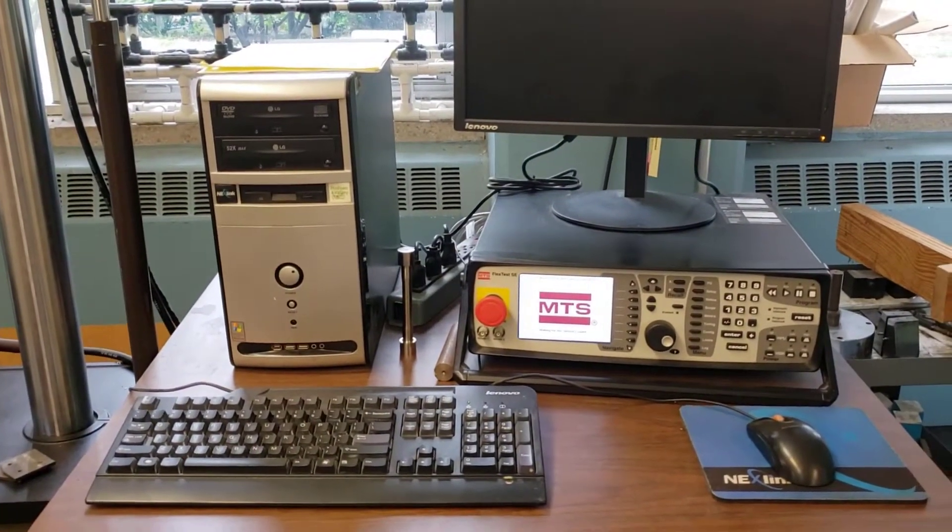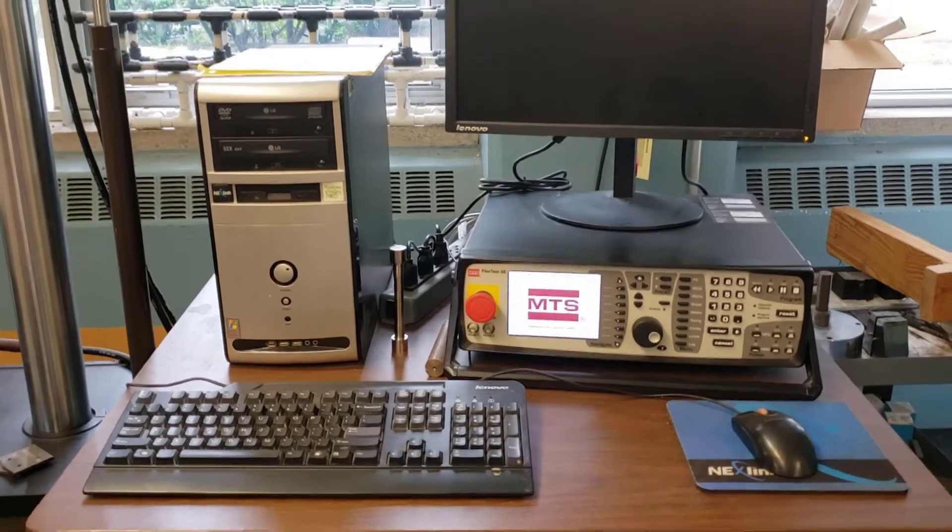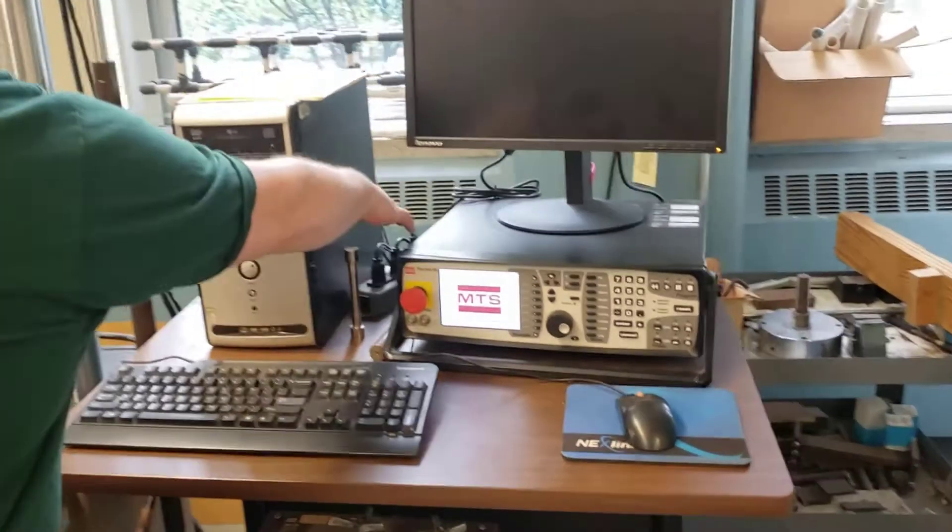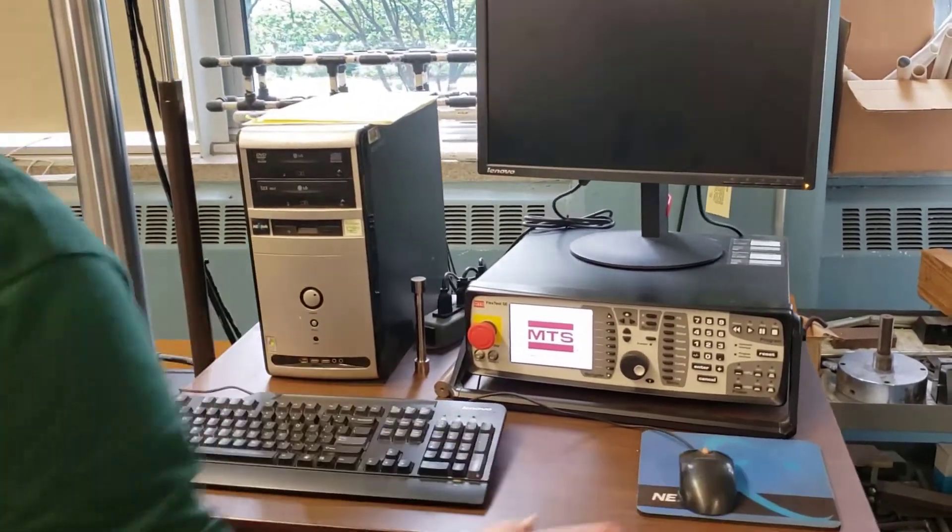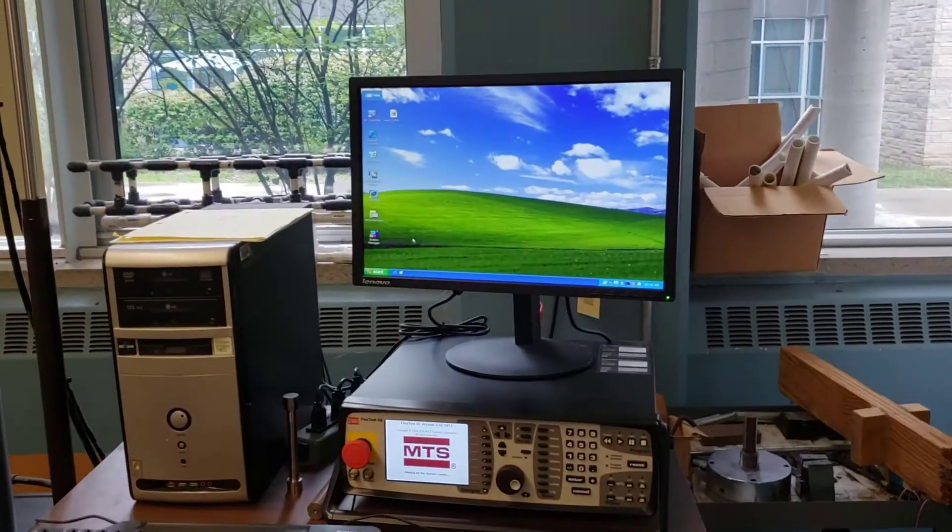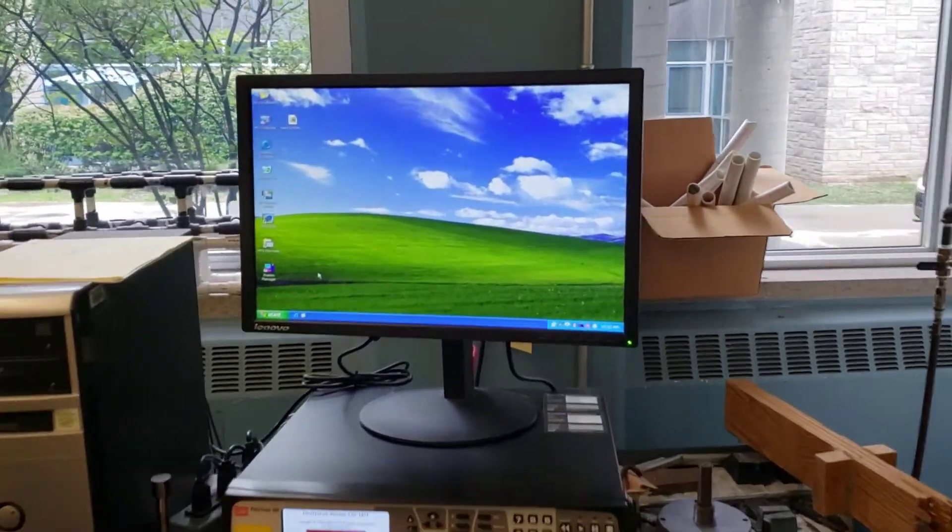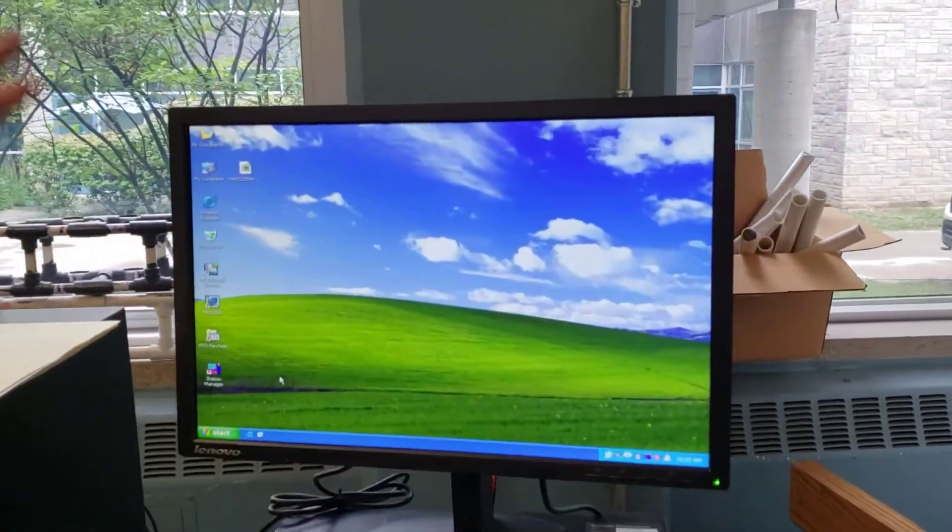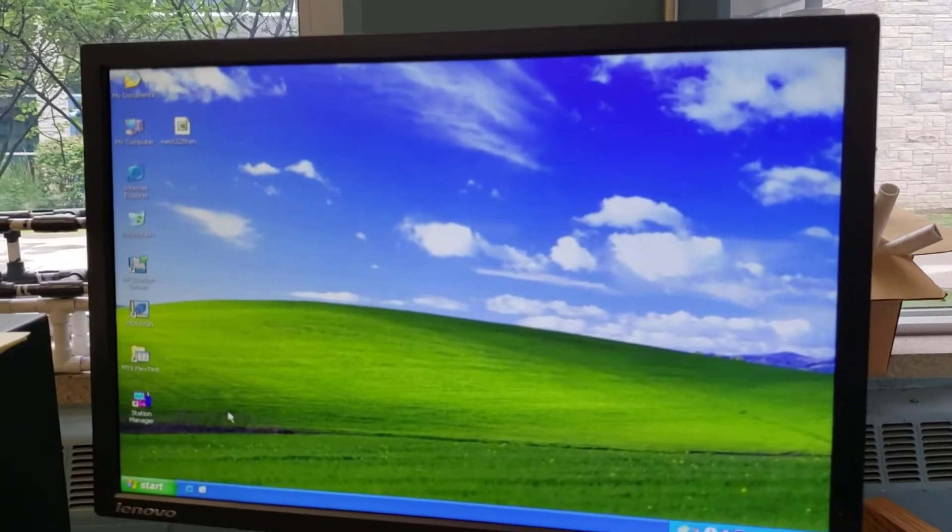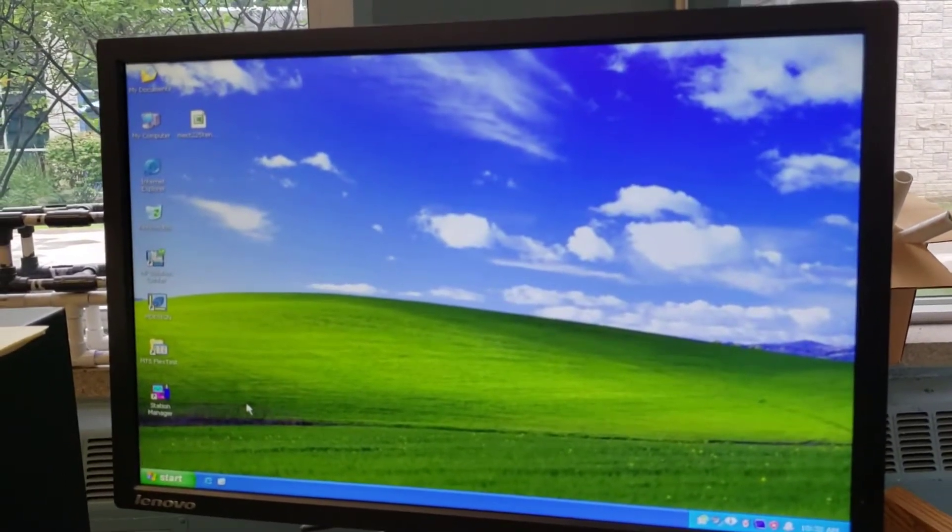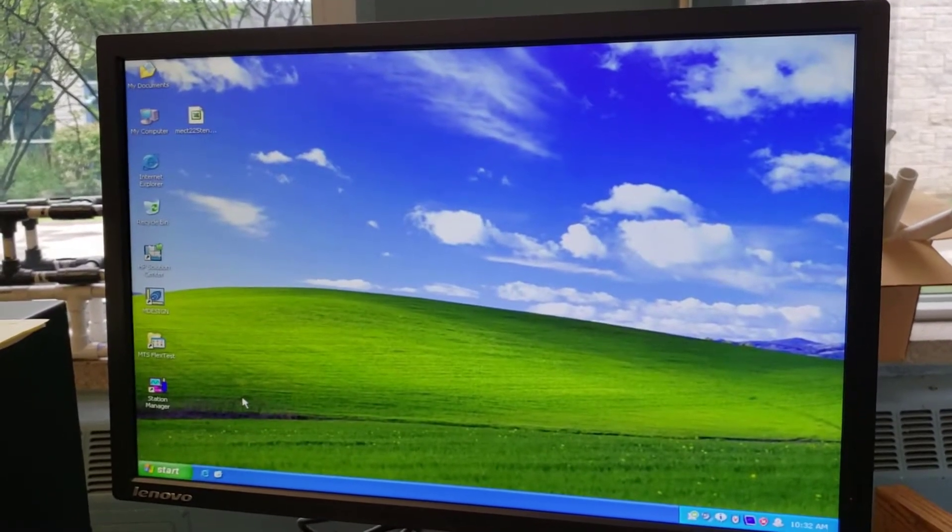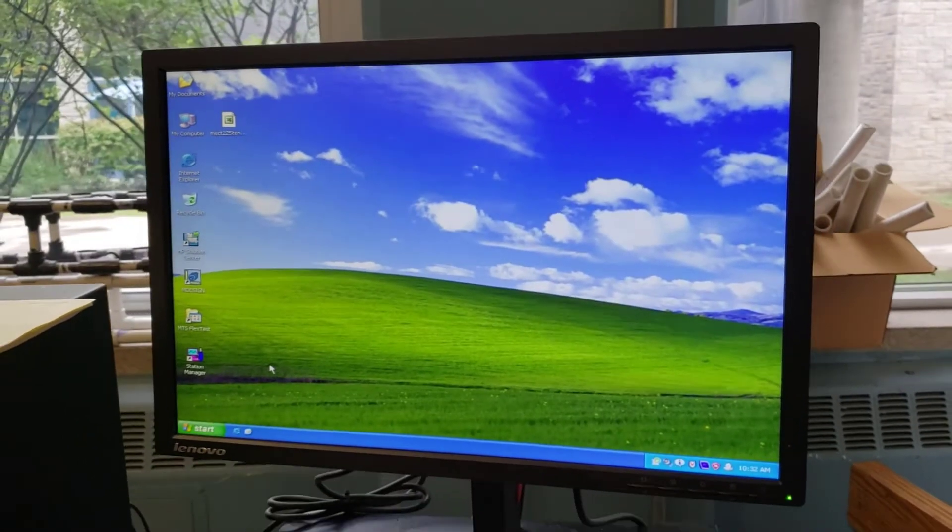I deliberately left everything off so I could show you the startup. When you power up on the power strip, you need to fire off the computer. You will notice it is Windows XP. I realize for some of you that's something of a history lesson, but just be aware it's not Windows 10. This is slightly older software.